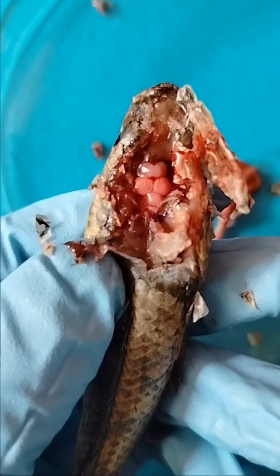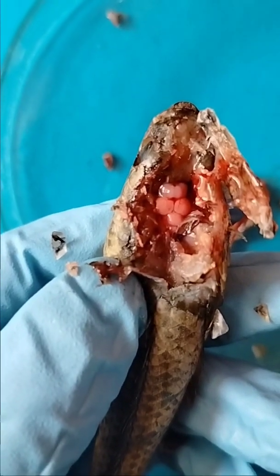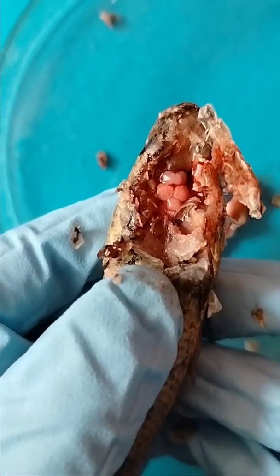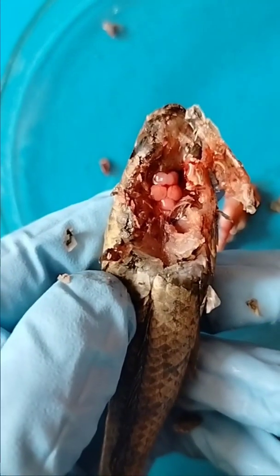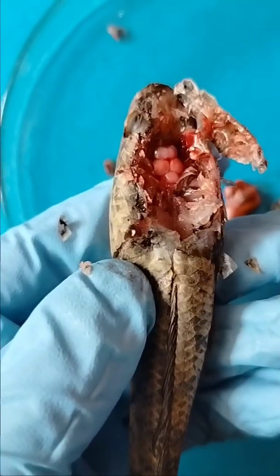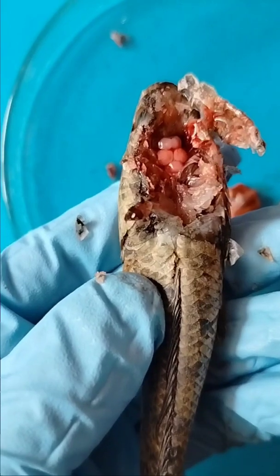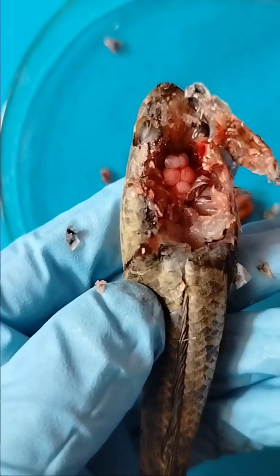Remarkably, the large cerebral hemispheres are characterized by two convolutions in each hemisphere. The dorsal convolutions are a little bit larger than the anterior lateral ones. The large oval inferior lobes are located at the ventral aspect of the diencephalon. The lobes encircle the infundibulum, which at its apex bears the pituitary gland, the master gland.